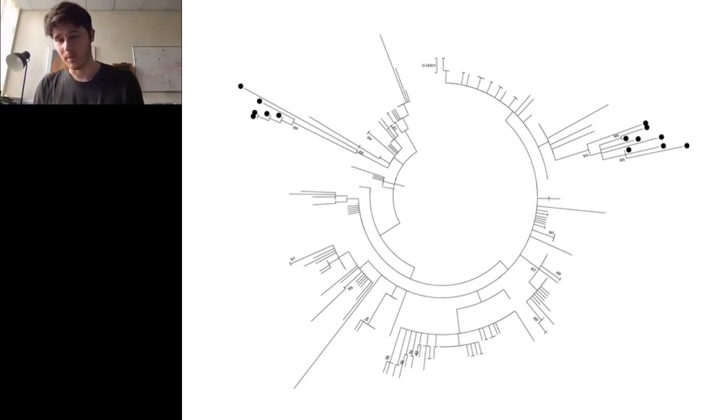If you don't have a mobile lab, the only way that you can get genomic data for these samples is by collecting them all up, packaging them and shipping them out with a special courier which is happy to handle potentially hazardous RNA, and then sending them to a lab which is equipped to handle them and do the genome sequencing there.